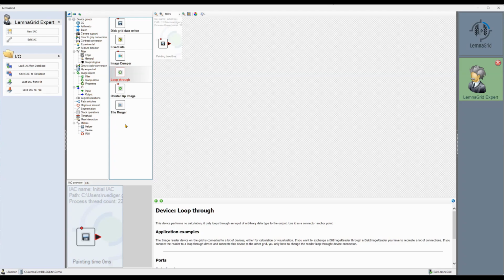First, we need 2 or maybe 3 readers, one for the red and one for the near-infrared channel. The third reader is a channel which we use for segmentation. Possible options are the RGB image taken by the multispectral camera, the far red channel, or the near-infrared channel.